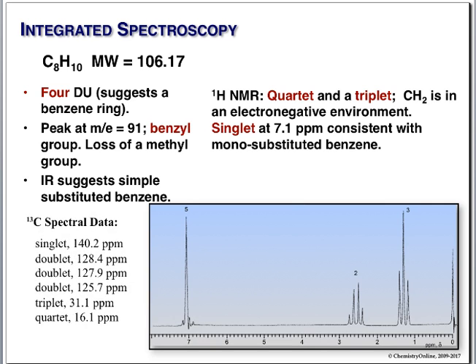Look at our C13. In our aromatic region, we have a singlet, a doublet, a doublet, a doublet. What does that tell us?